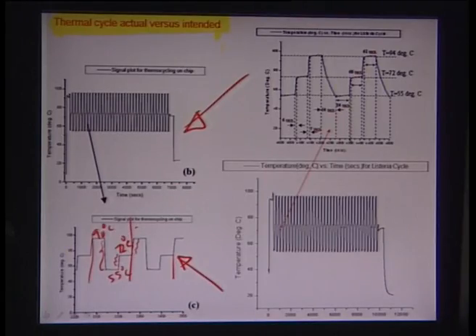So the ramp up and the ramp down rates are very, very critical to determine the overall time step that the reaction would need. Of course, there is a hold time at a certain step, because that is rate limited by other mechanisms like diffusion and enzyme kinetics, as we have been talking about before. But if we assume that those hold times at different temperatures are primarily fixed, we do have the flexibility and luxury to vary the ramp up and ramp down rates, so that we can squeeze the cycle more and make it less time consuming.